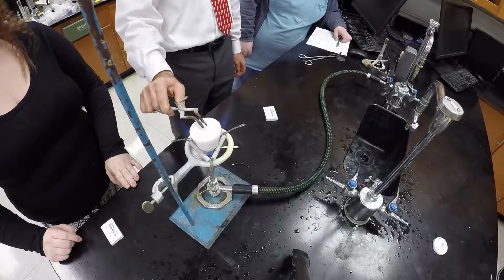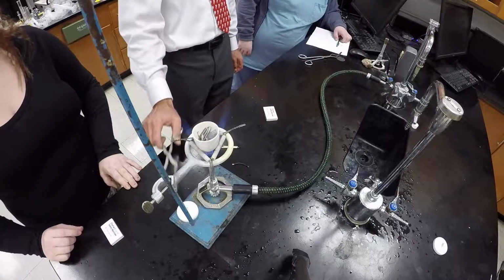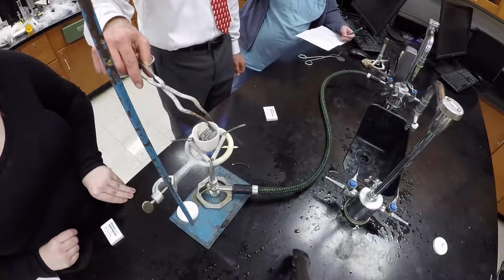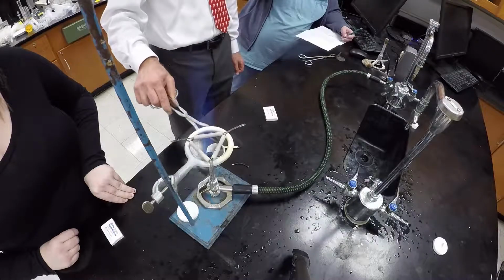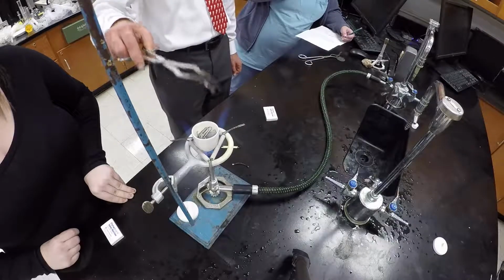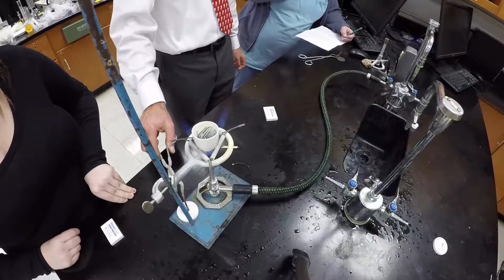To remove it, I grab it tightly and I'll place it on the ring stand, because the table might cause it to cool too fast and it could break. So when you want to remove the crucible bowl, it's the same way. I grab it like this, take it to the ring stand, let it cool. Actually, we want to let it cool on the triangle first when we turn the gas off, and then we'll take it to the ring stand.